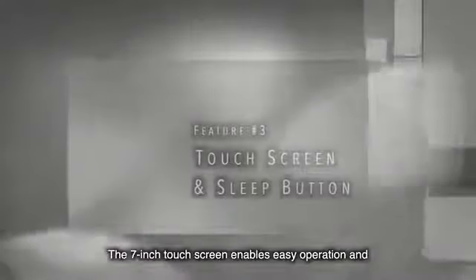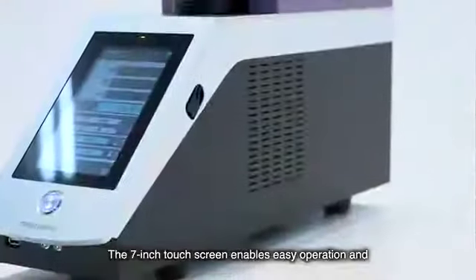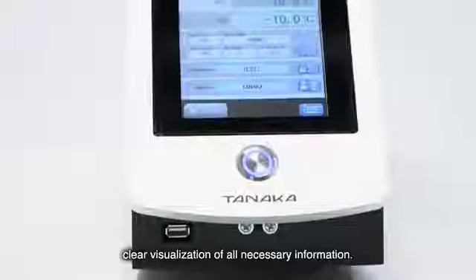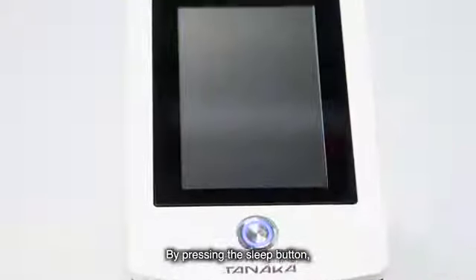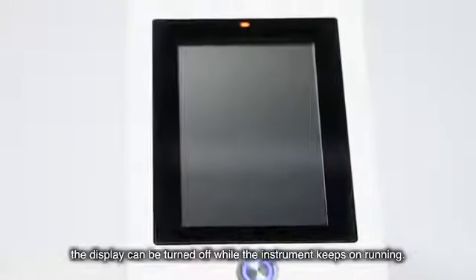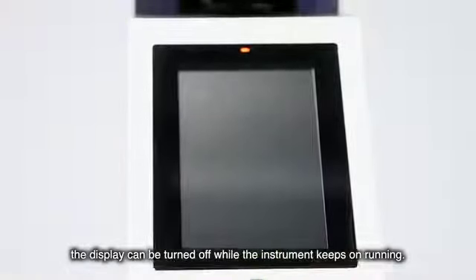The 7-inch touchscreen enables easy operation and clear visualization of all necessary information. By pressing the sleep button, the display can be turned off while the instrument keeps on running.